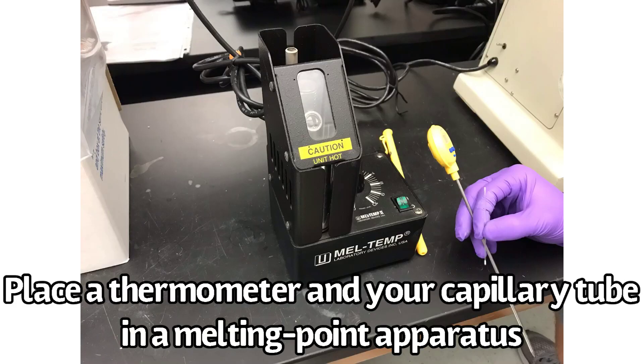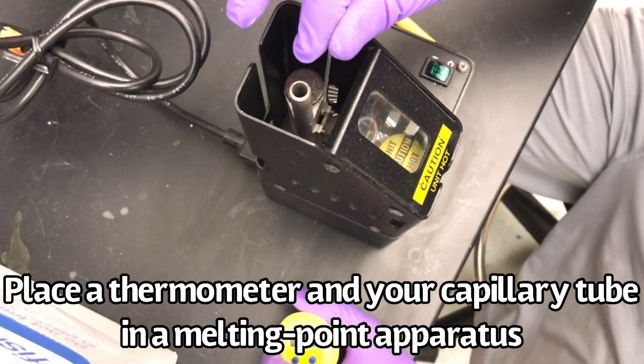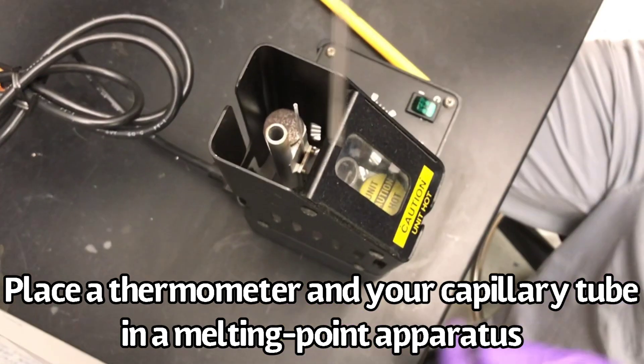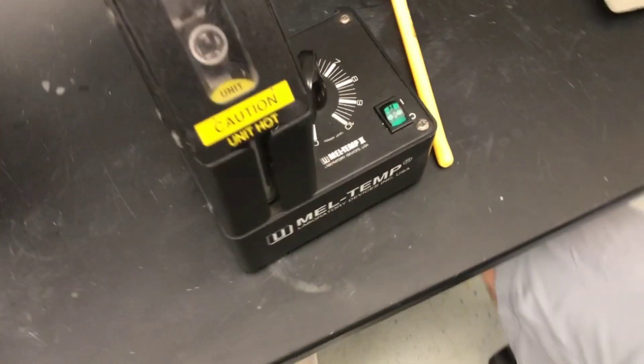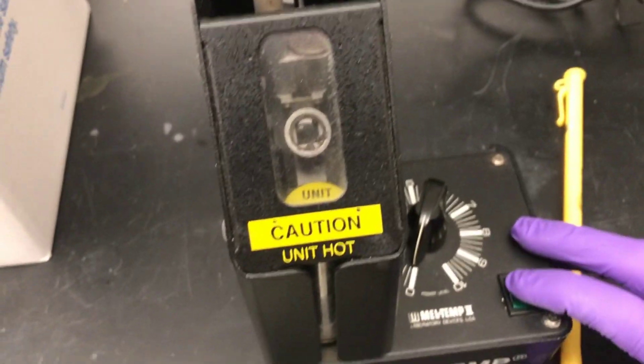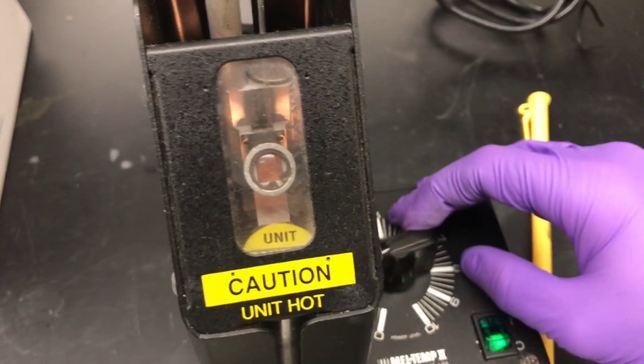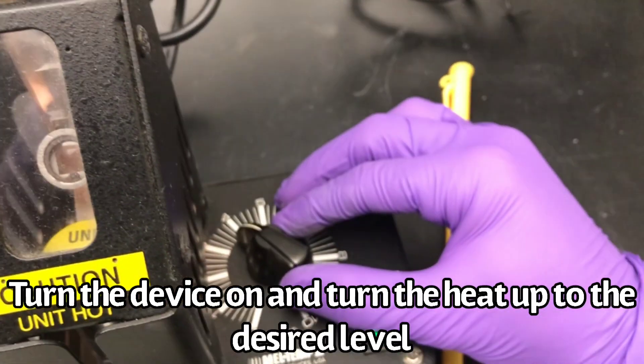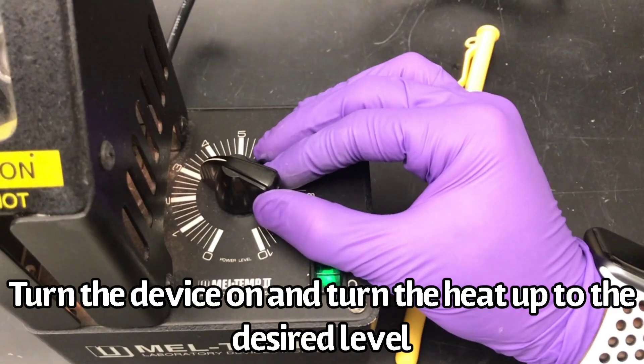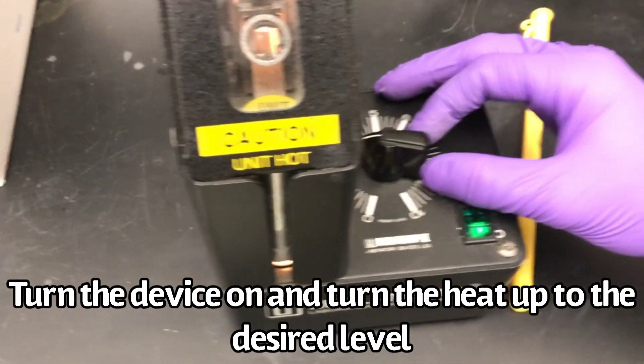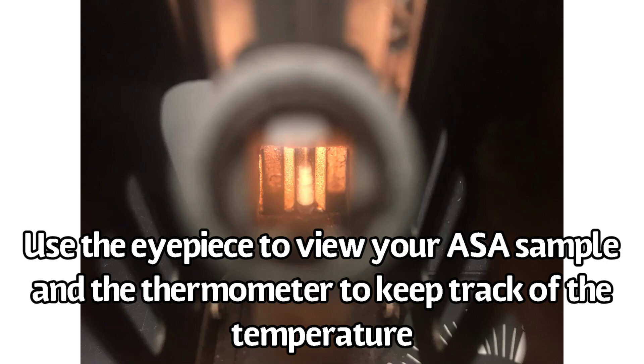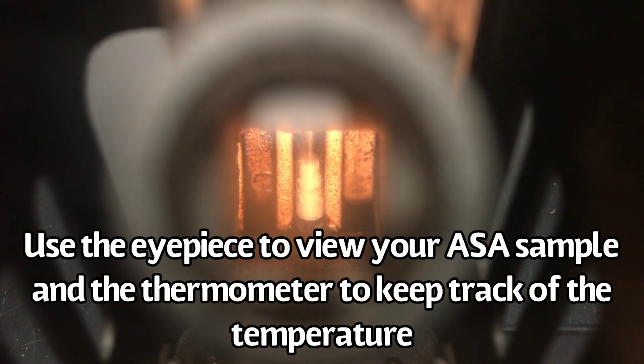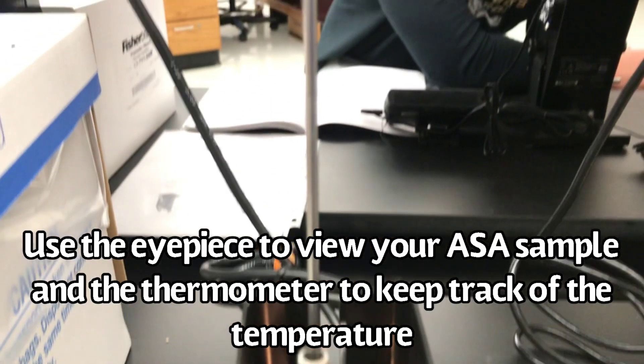Place a thermometer and your capillary tube in a melting point apparatus. Turn on the device and turn the heat up to the desired level. Use your eyepiece to view the sample and use a thermometer to keep track of the temperature.